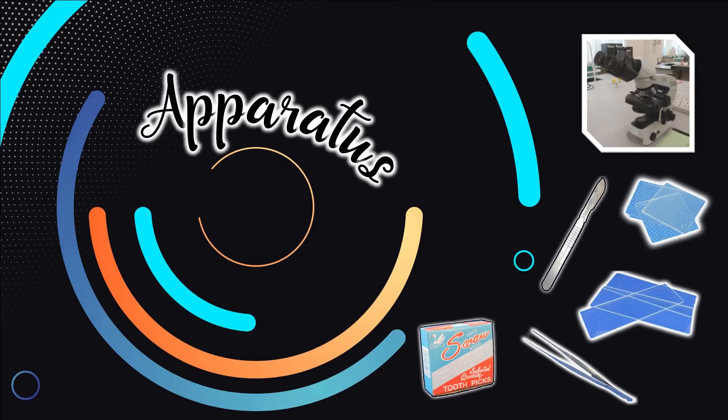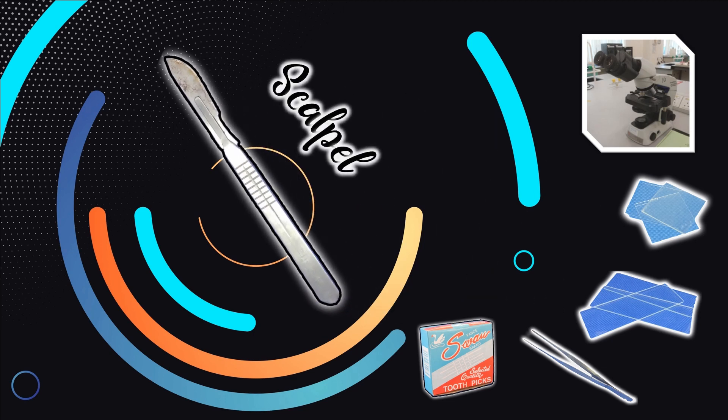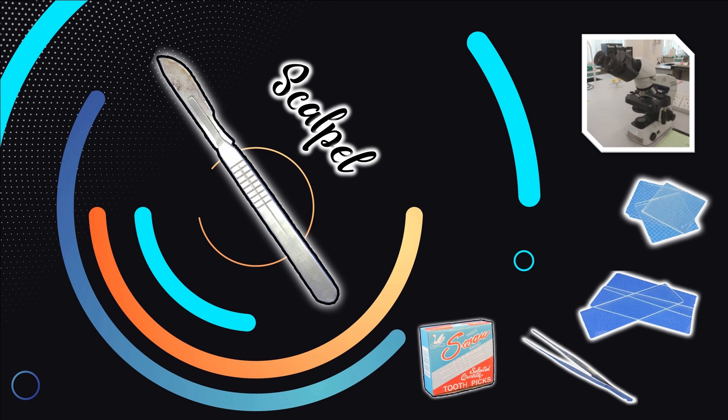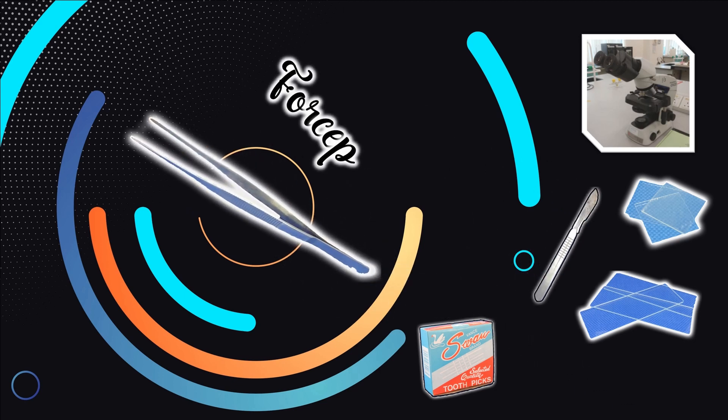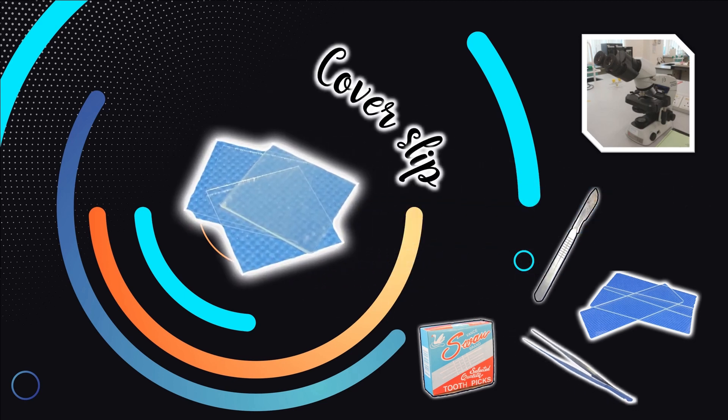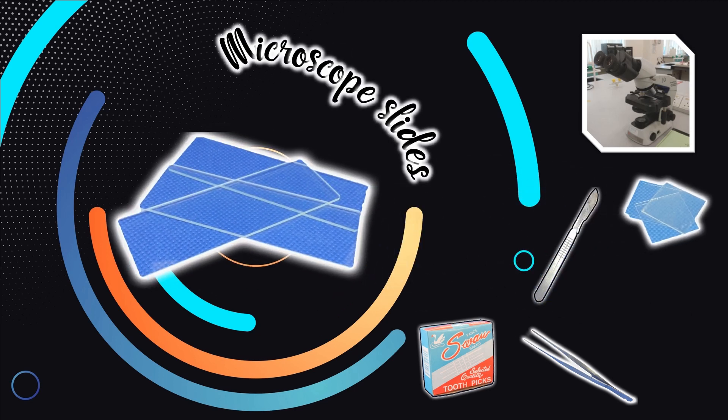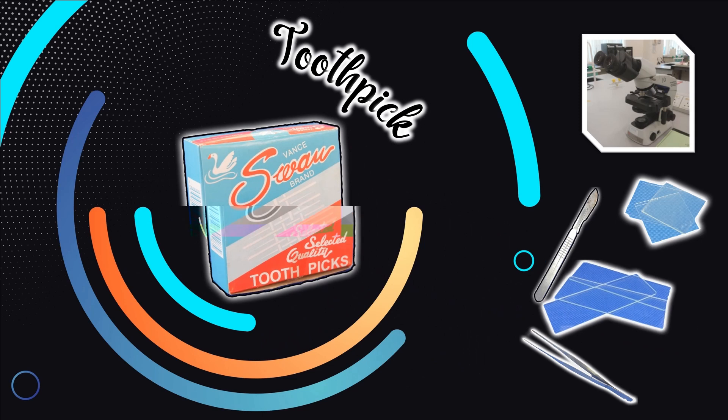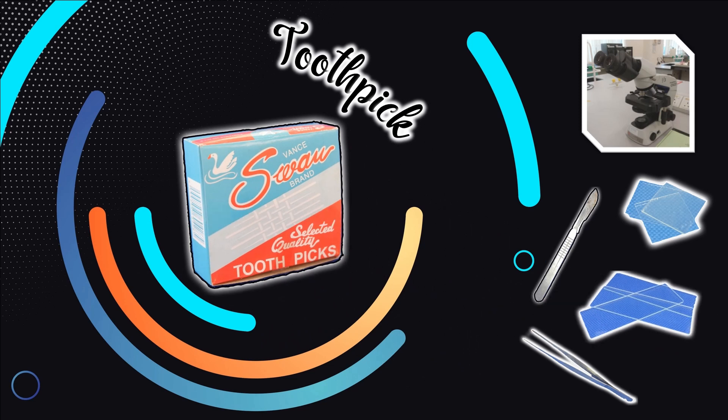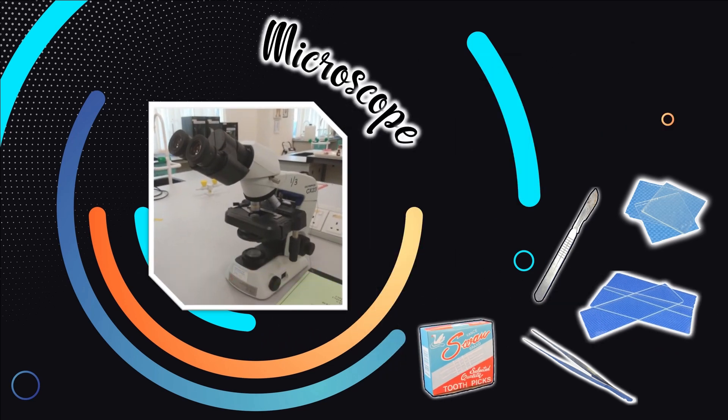Six apparatus to complete this experiment. The first one is scalpel, forcep, cover sleeve, microscope slides, toothpick and a microscope.